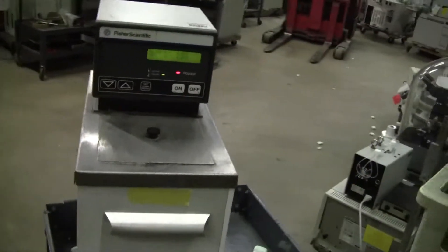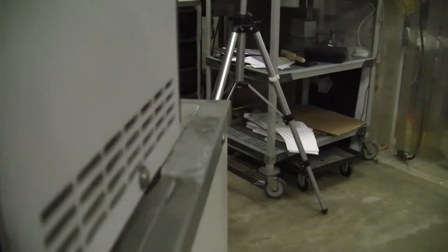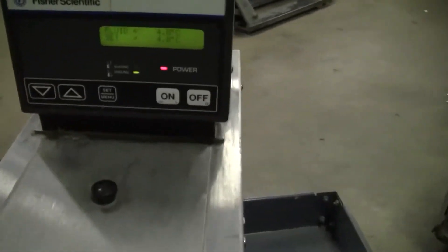Hi, this is Jim from HightechTrader. We're doing a Fisher Scientific Heater Chiller, model 9101. This has a temperature range of minus 20 to 200°C. It's a 6-liter batch.